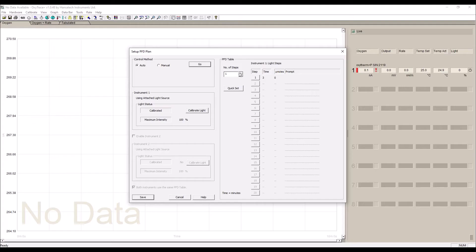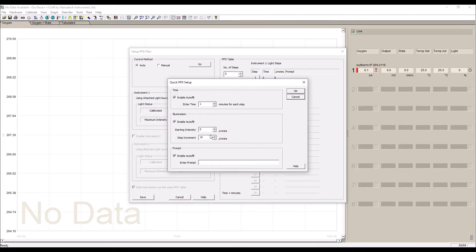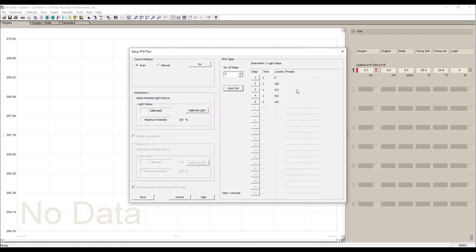You can configure photon flux density tables of up to 20 individual light steps for automatic execution during an experiment, together with calculation of quantum yield at each step.